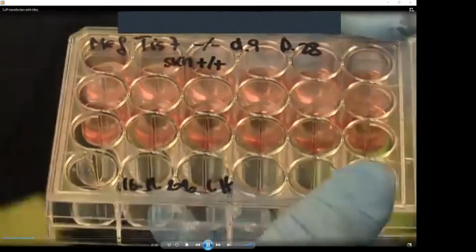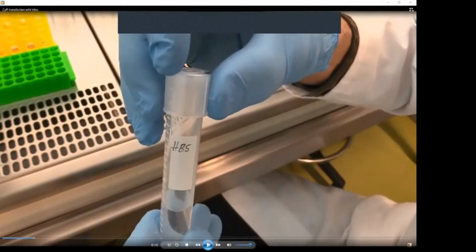Next thing which you see in the very first moment is the color of the media. And now we are coming to the transfection. So what do you need for the transfection? This is the easiest technique, which is the cheapest technique. It is called calcium phosphate transfection. The disadvantage of this technique is very low efficiency.